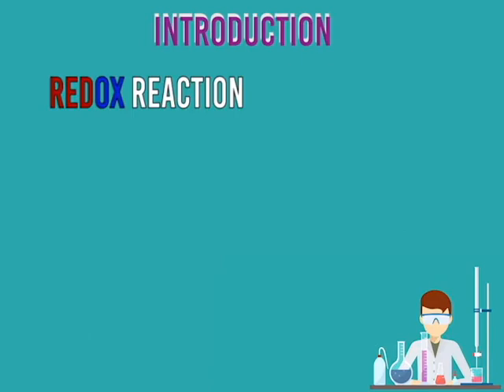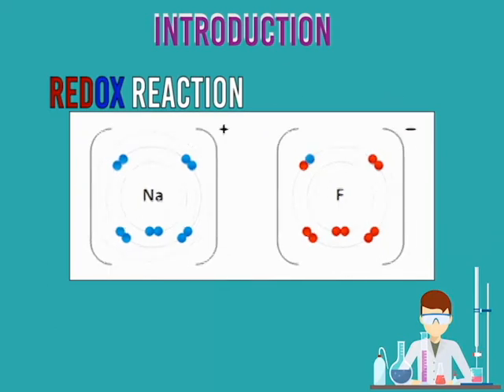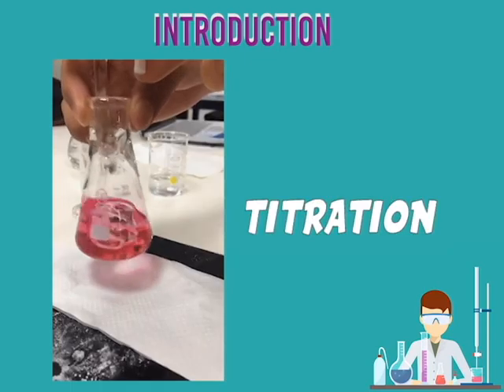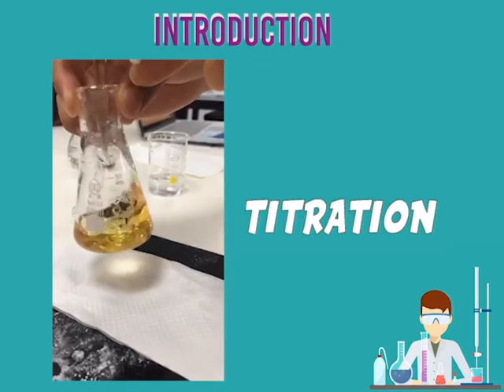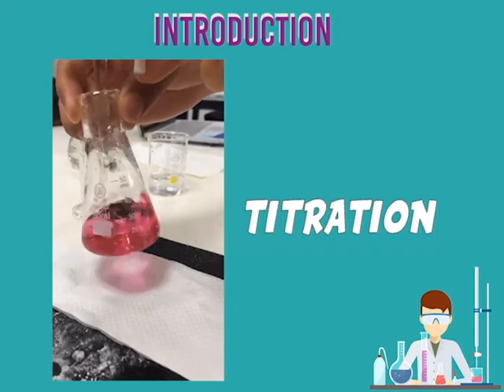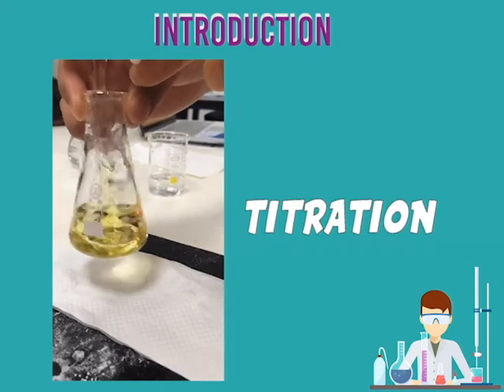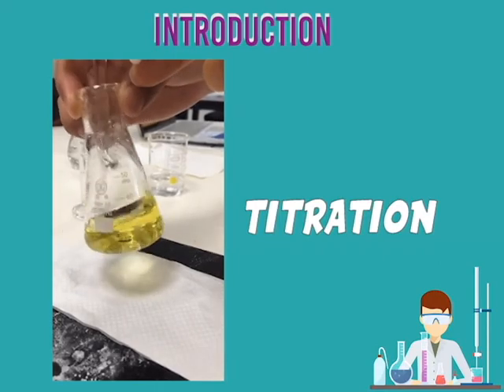Following the principles of redox reaction, the number of electrons lost by the species being oxidized is always equal to the number of electrons gained by the species being reduced. On the other hand, titration is a method of volumetric analysis wherein volume measurements are used to obtain the concentration of an unknown solution. Redox titration can be used for an analyte that can be oxidized or reduced.